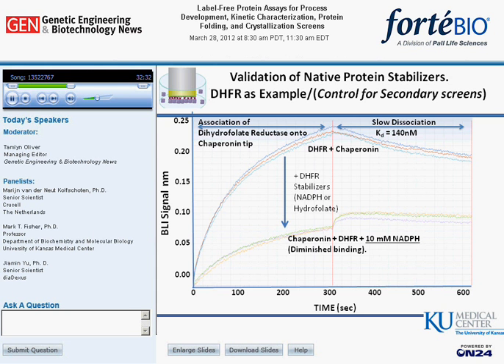In the first case, the older experiments of Lormer's group were simply recapitulated, and these experiments clearly demonstrate that we can rapidly identify naturally occurring protein-binding ligands that result in the stabilization of this protein. As seen previously, the presence of stabilizing ligands results in a marked decline in signal due to the decrease in DHFR's binding to the immobilized chaperonin.